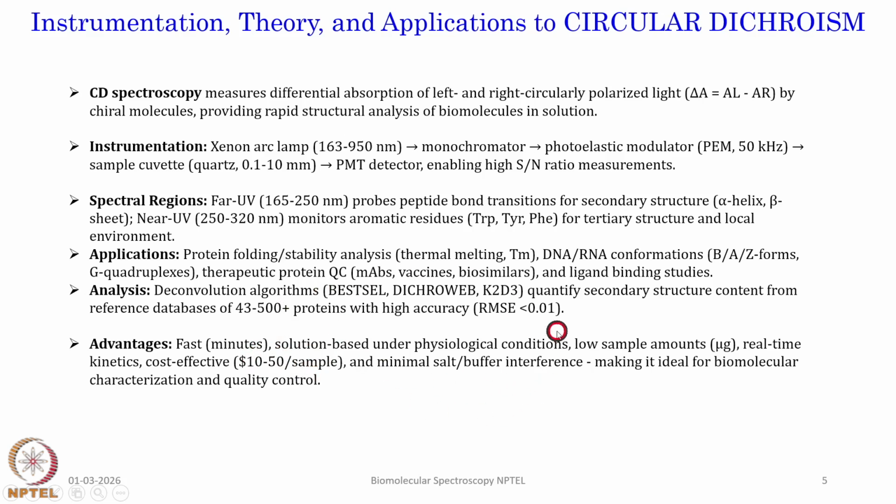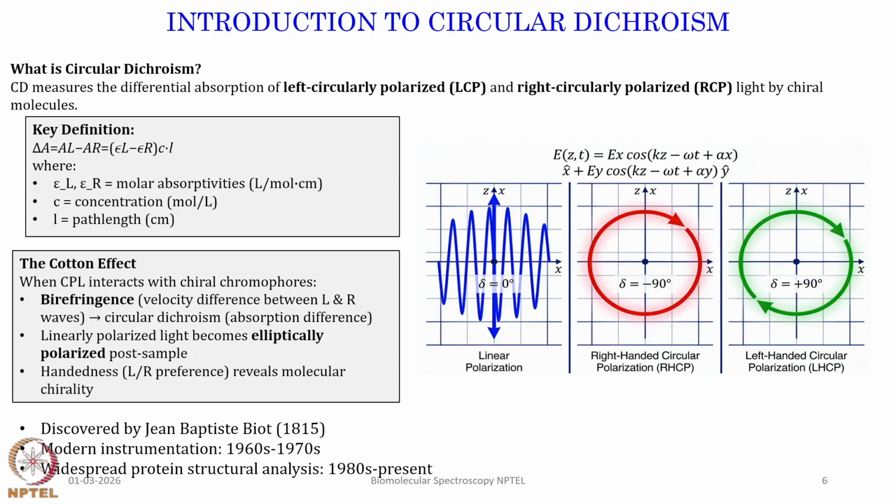You require minimal sample, and salt and buffer interference can be there, but we can subtract that. This makes it an ideal technique for biomolecular characterization, and also for industrial application, where it gives you an idea about quality control.